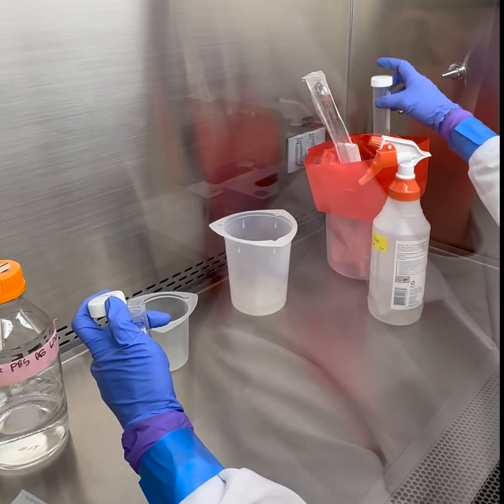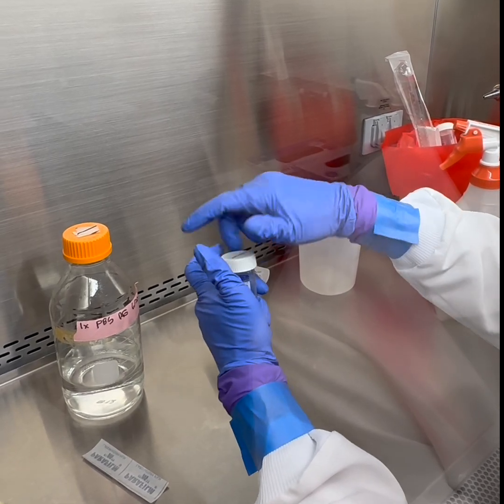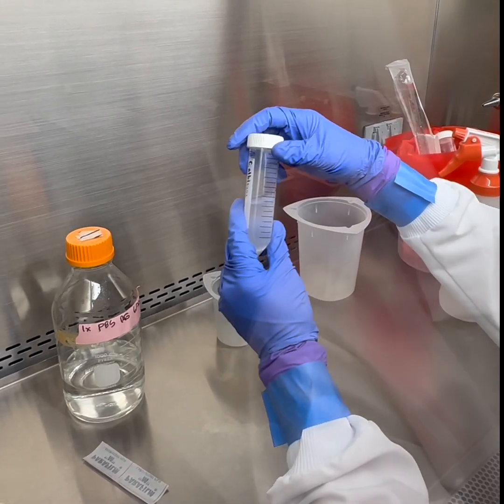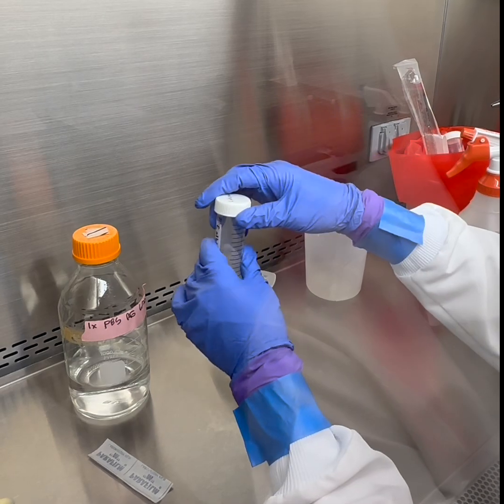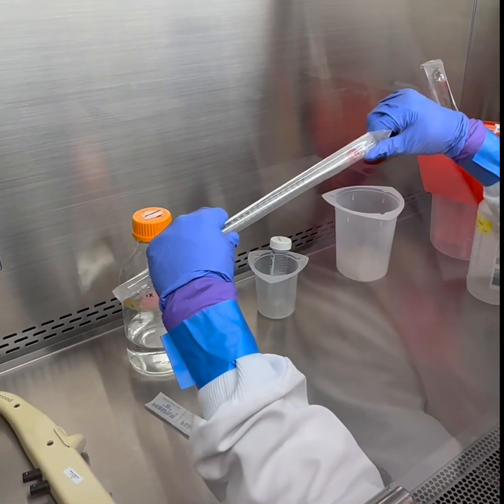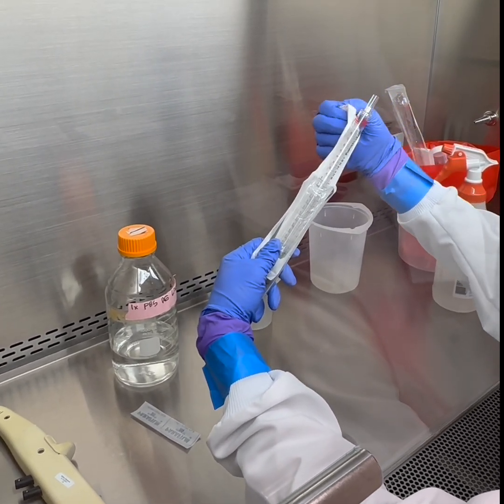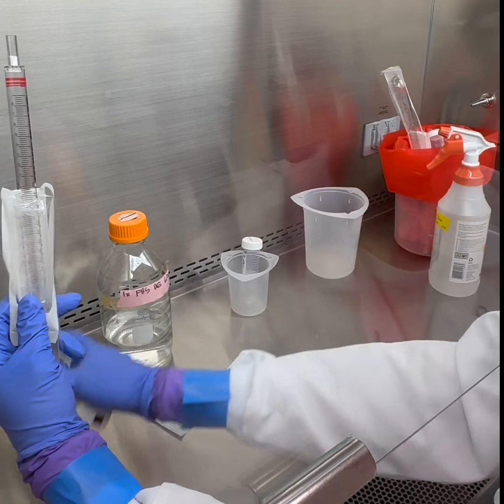You want to vent it in the bag so that it doesn't pop off in the autoclave and explode. At this point you can vortex vigorously, or I prefer to use a serological pipette to resuspend. I think it's safer. It creates fewer aerosols.